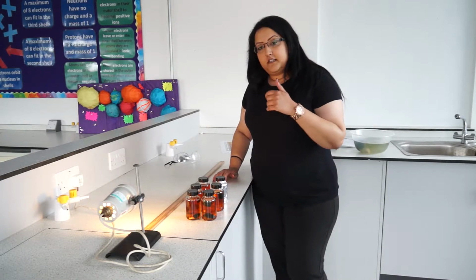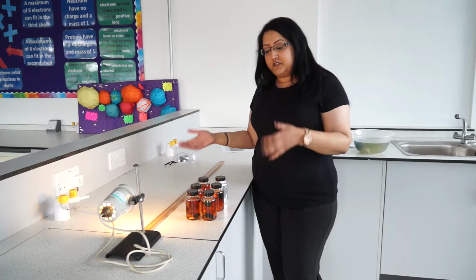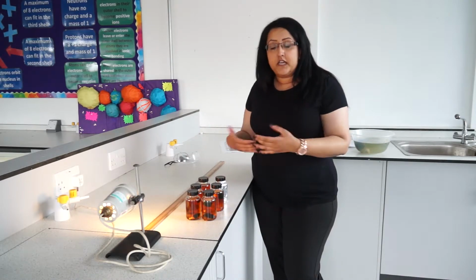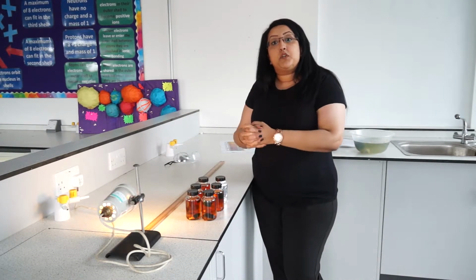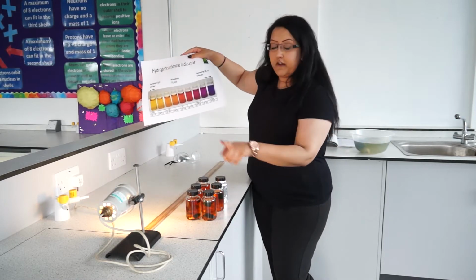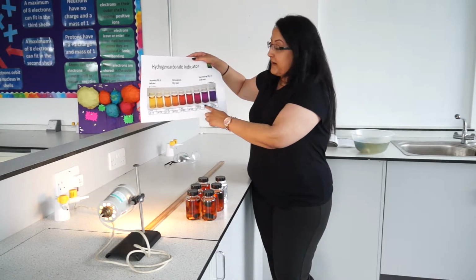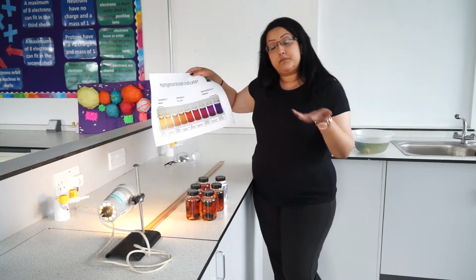Now, we're going to be looking at how the light intensity affects the rate of photosynthesis. If a plant is photosynthesizing lots, it will use lots of carbon dioxide. So we're expecting the colour of our indicator to go down this side, to a purpley colour, because we're expecting the carbon dioxide to be used up.